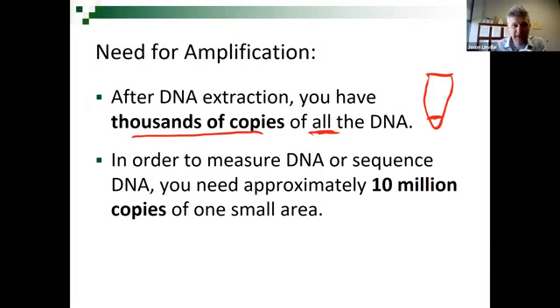And we just want to amplify those areas of DNA, small areas of DNA that are maybe like 300 base pairs long or something like that. That's all we want to amplify. So at the end of this amplification process, we're going to amplify the one small area. Except we're going to amplify like 13, 16 of them at a time. In class, we're going to pick 3 of them at a time. That's not important, but it's just a small area and we're going to make a copy.